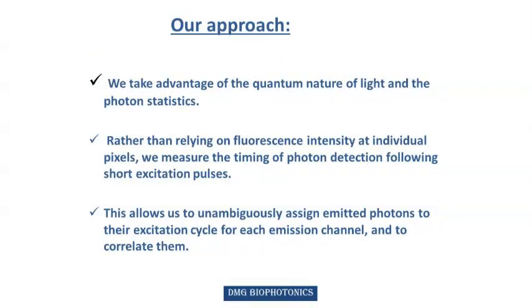The quantum nature of light opens new horizons in microscopy. Instead of measuring light intensity, we focus on detecting individual photons. Using time-correlated single-photon counting, each photon is tagged with two timestamps, one marking the time from the start of the experiment and the other from the excitation pulse. This allows us to unambiguously assign emitted photons to their excitation cycle for each emission channel and to correlate them.